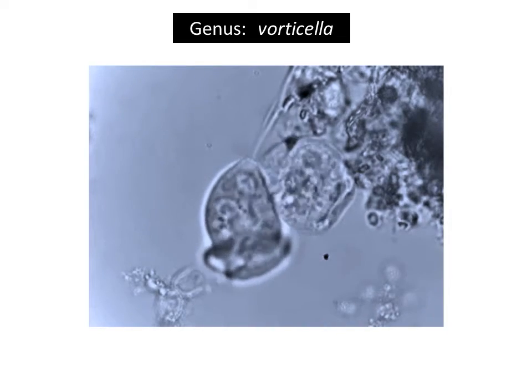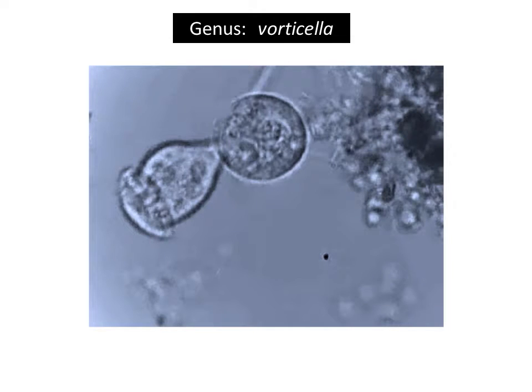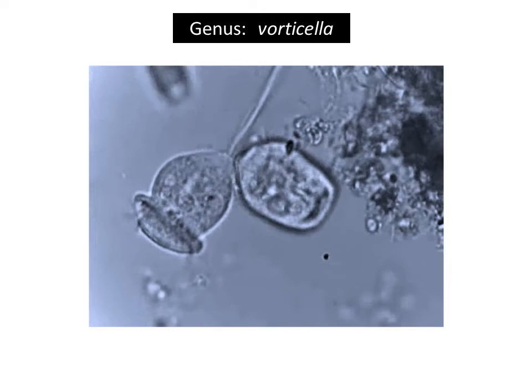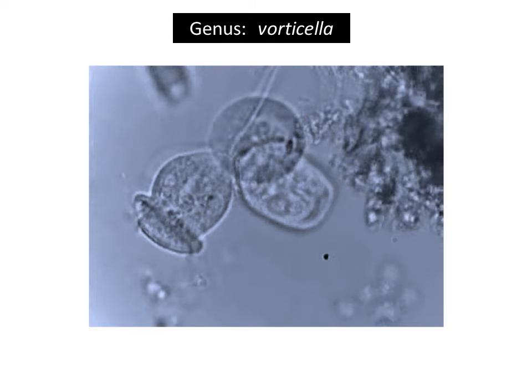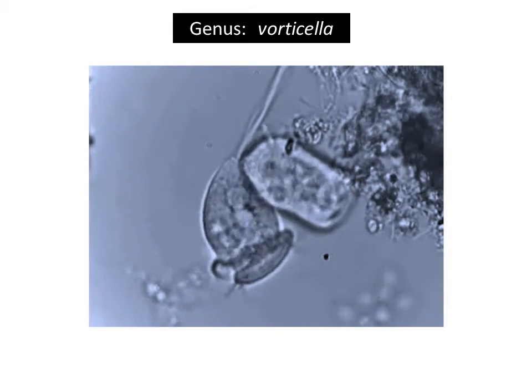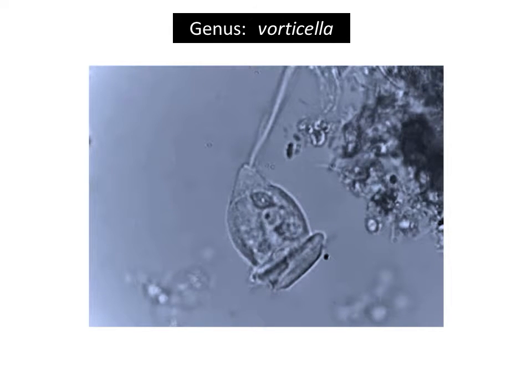The daughter cell contracts into a spherical shape, and then it expands into the semi-rectangular shape of the almost mature telotroch. Now there is further extension of the length of the telotroch, and when the vorticella swings away and returns, it has released the telotroch.